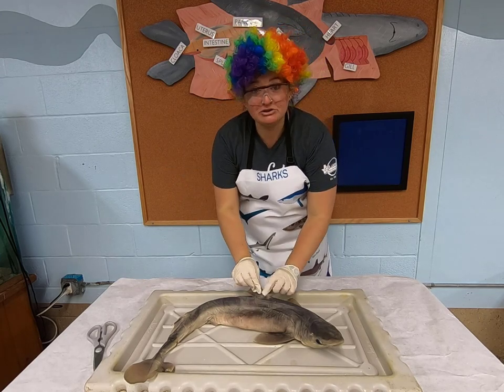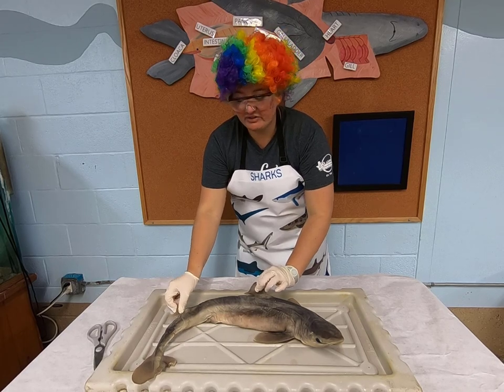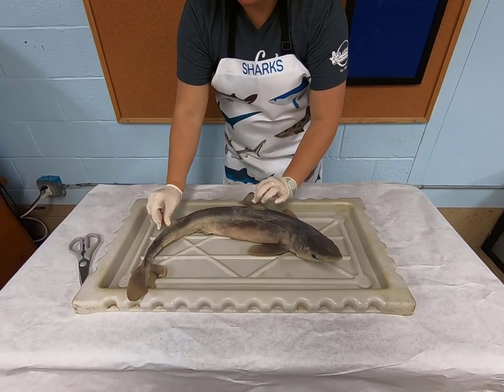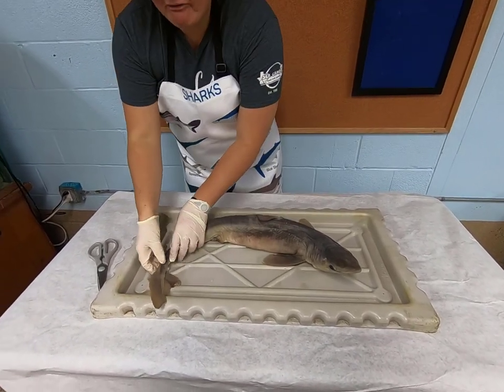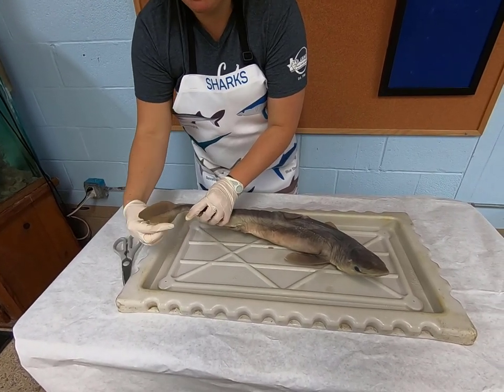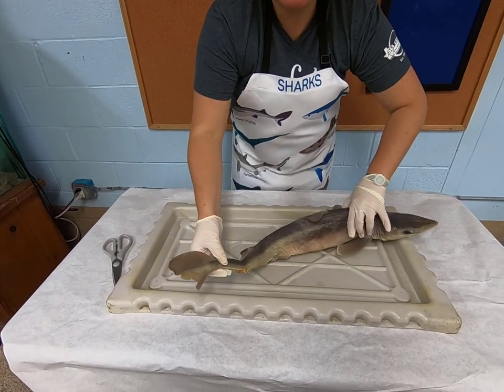We also have dorsal fins. Not every shark species has two dorsal fins, but the spiny dogfish does. They have two dorsal fins right here, and that's also to help with balance. They have their caudal fin right here. Their caudal fin is for propulsion. So their caudal fin helps them to move through the water.